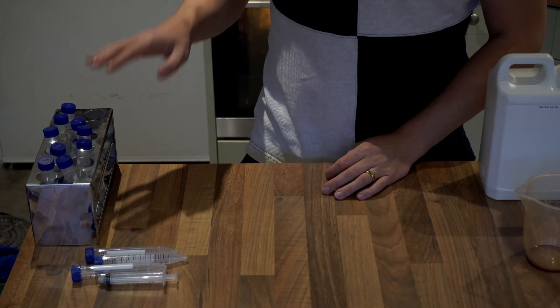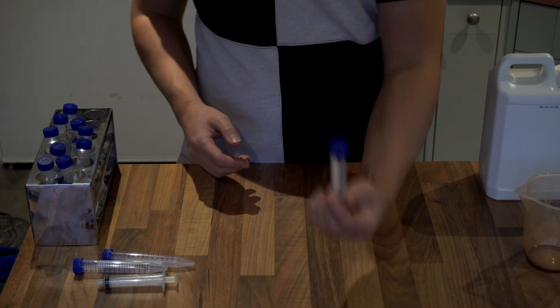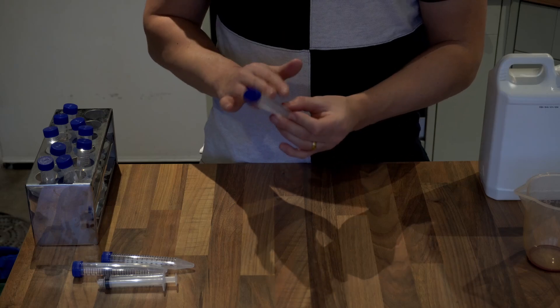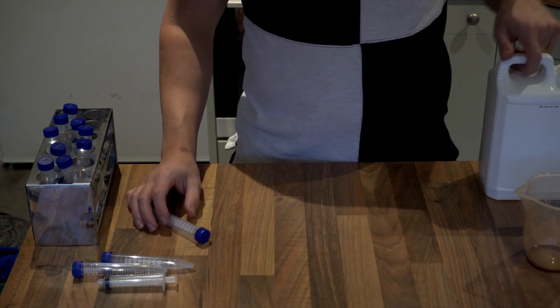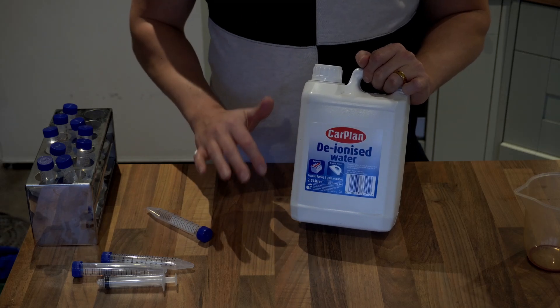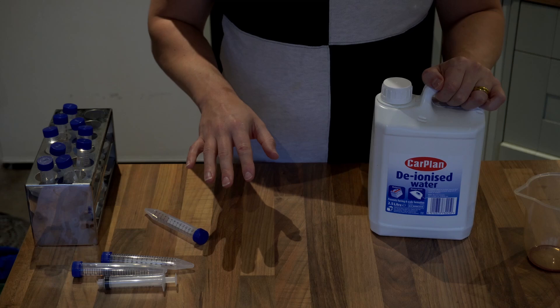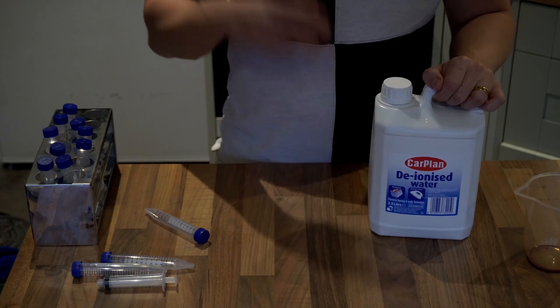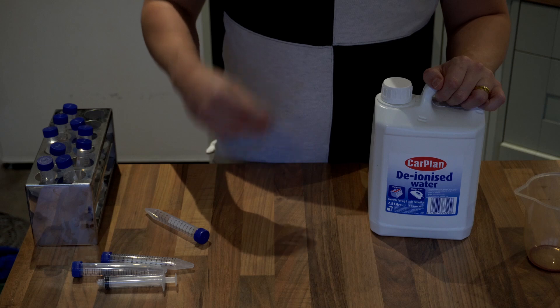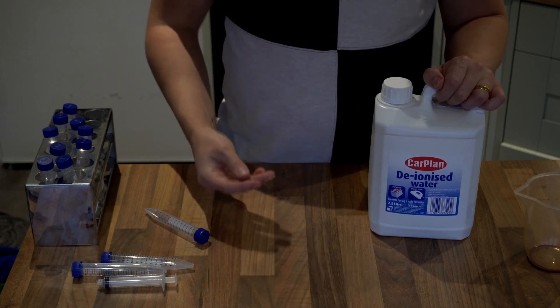How does this method work? Basically, because the mushroom cultures are stored in distilled water they don't get any food or nutrients, and because they are inside a small test tube which is closed, they can't get any gas exchange, so they go into a dormant state because they can't continue replicating. On top of this, the water is sterile so there are no contaminants which could destroy the mushroom culture, and finally the water's hydrating properties means that the fungal cells manage to stay alive.